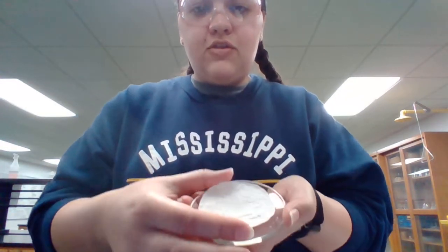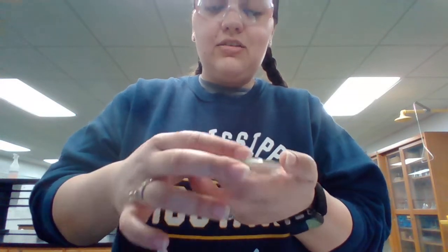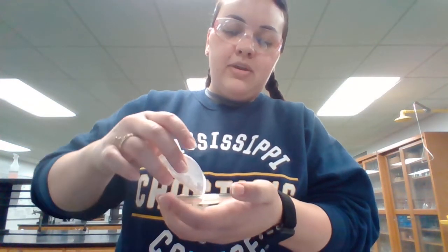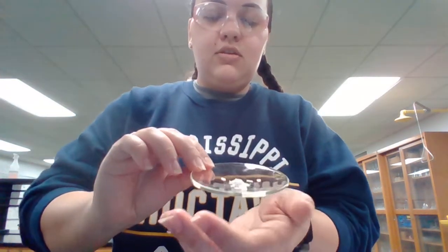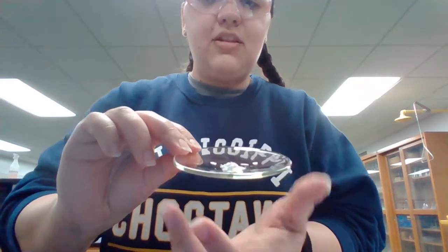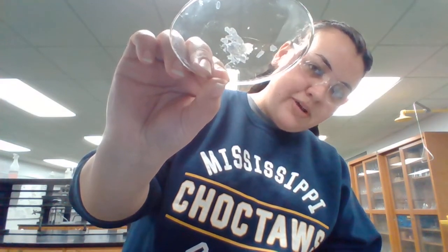So like I said, your solid is white, and I actually have some here. If you can tell, it's super difficult to see that solid on there. You can kind of see it caked on the filter paper, but mine is super dry, so I can actually get some off the filter paper for you. And that's my white solid. The light's reflecting, so that's not really that great. Oh, that's better. Okay, so that's my white solid.